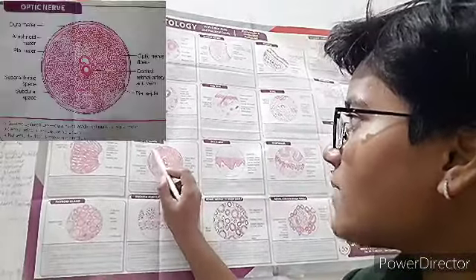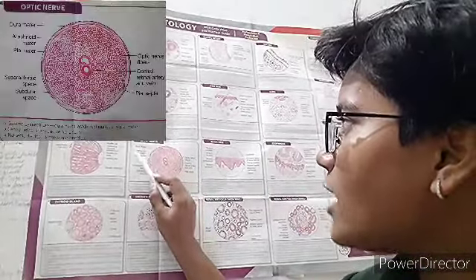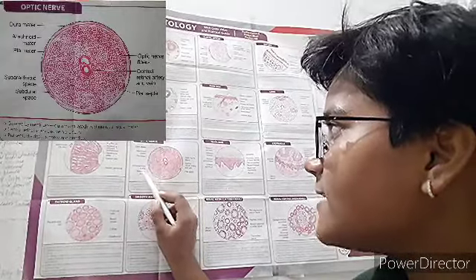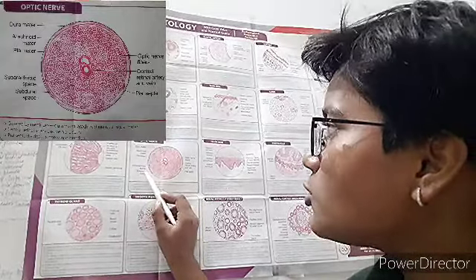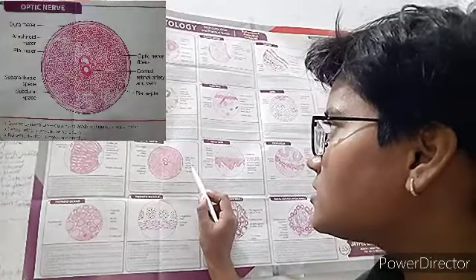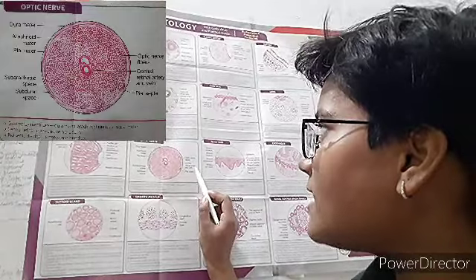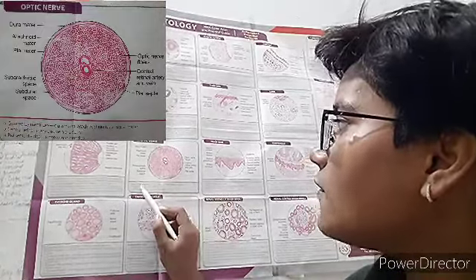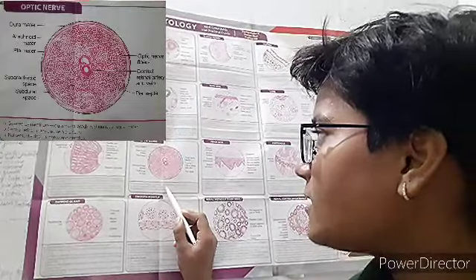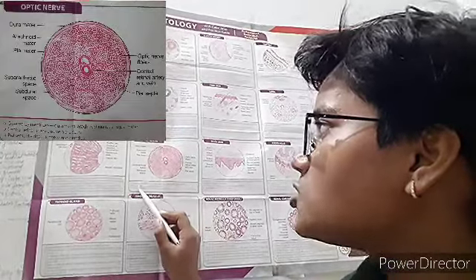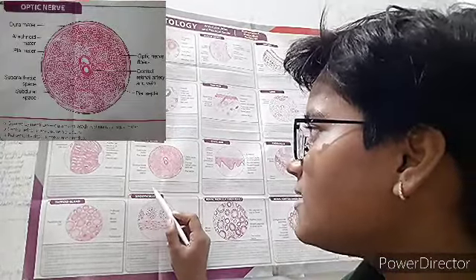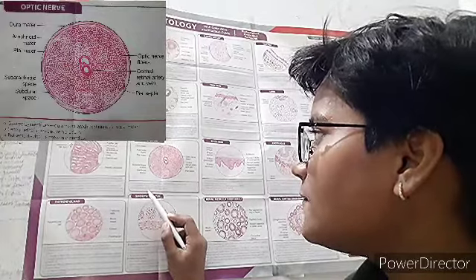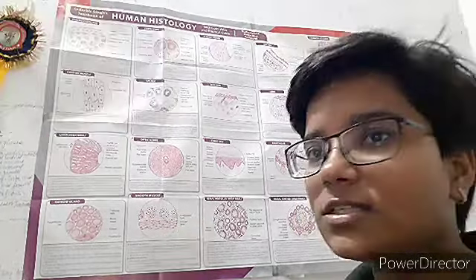Now the optic nerve. Visible structures include dura mater, arachnoid mater, pia mater, subarachnoid space containing CSF, subdural space, optic nerve fibers, central retinal artery, and vein, and pial septa. The optic nerve is covered by meninges — dura mater, arachnoid mater, and pia mater. The central retinal artery and vein are seen. Pial septa divide the nerve into bundles.